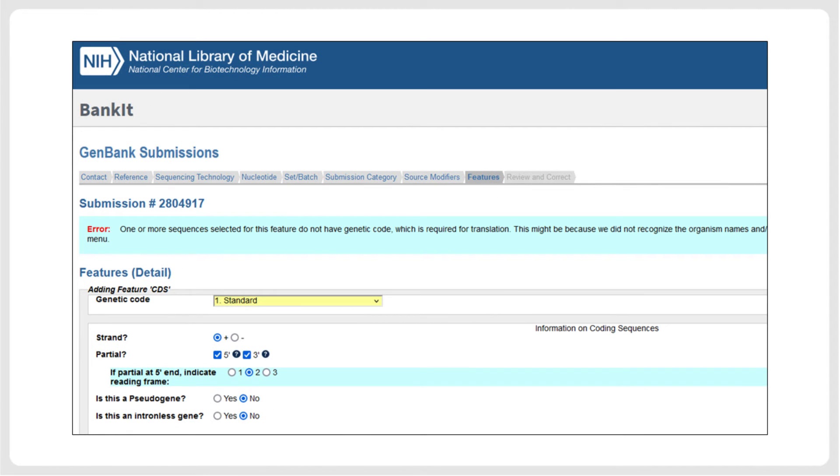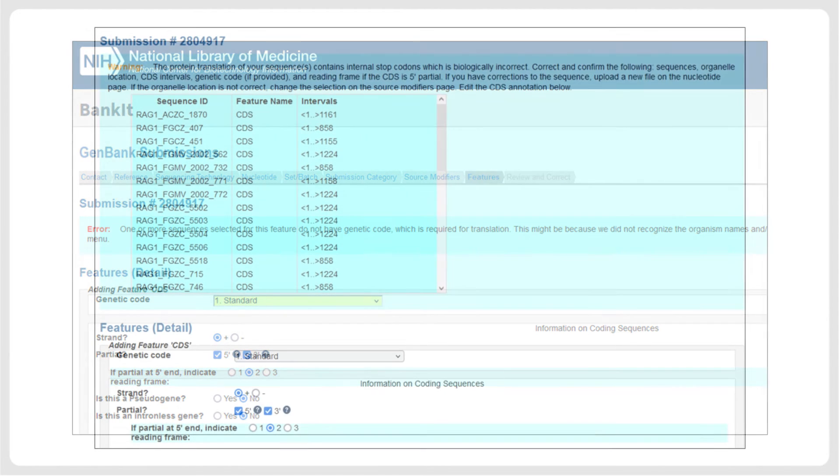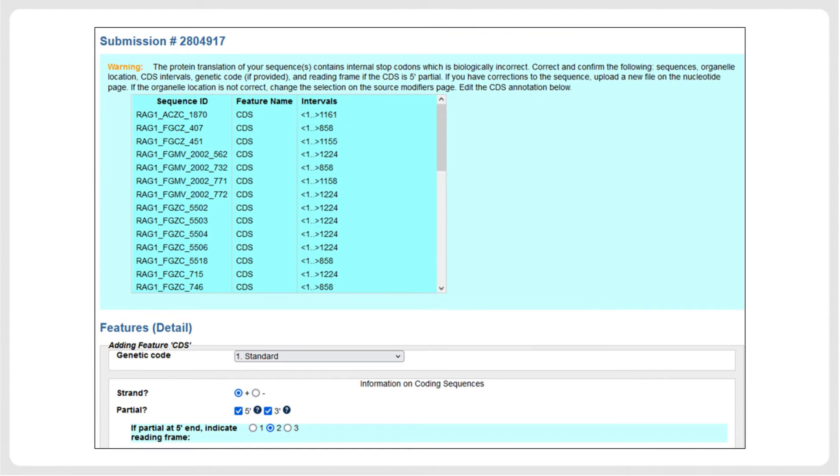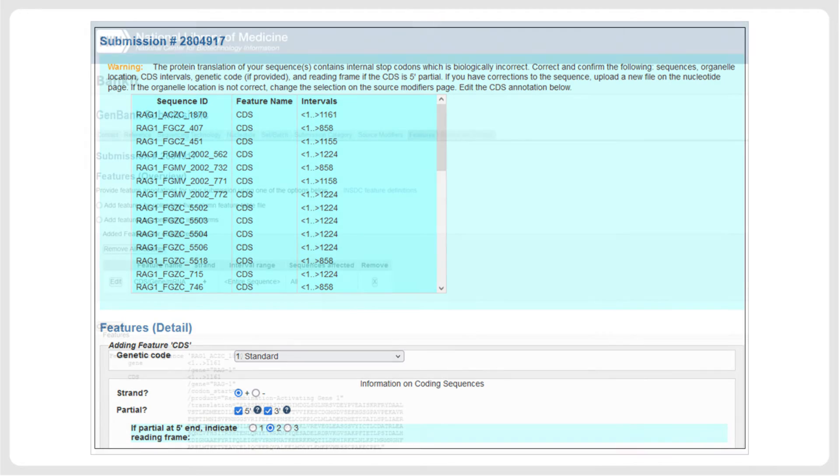In the next step, we need to specify the genetic code, which in our case is standard. If we have specified the wrong reading frame, an error message appears. As long as all sequences are in the same reading frame, we can easily correct this by choosing the correct reading frame, and then pressing the Accept button at the end of the page again.